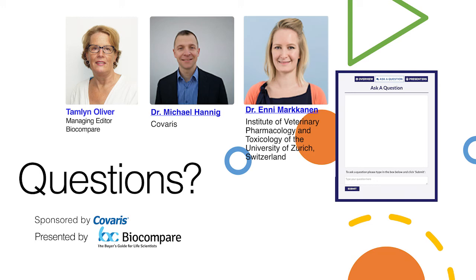But usually 10 microns is really also good to still see tissue architecture, tissue morphology quite nicely under the microscope. So to the next question regarding what length and width of tissue size that you excise, we have never really measured because it so depends on your sample. In some tumors, for us, because we're isolating the stroma, it's extremely simple to find big chunks of stroma, which you can just isolate in one go and you're done very, very quickly with isolation from that sample.